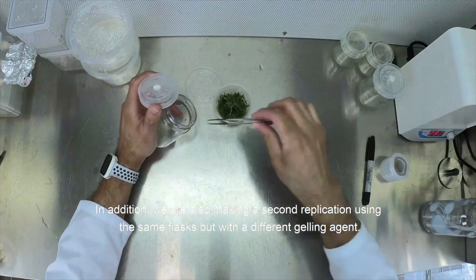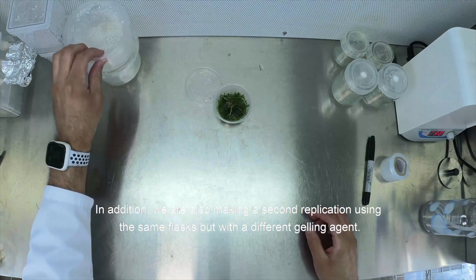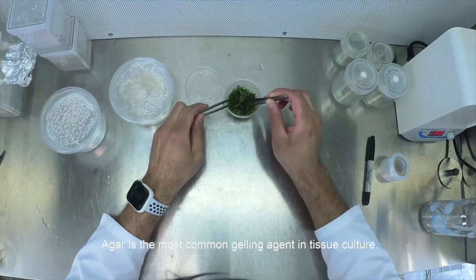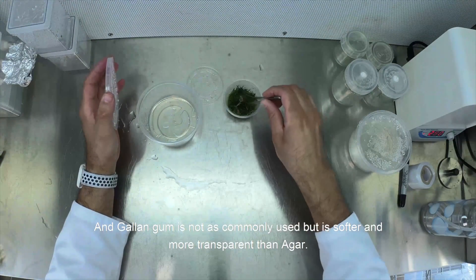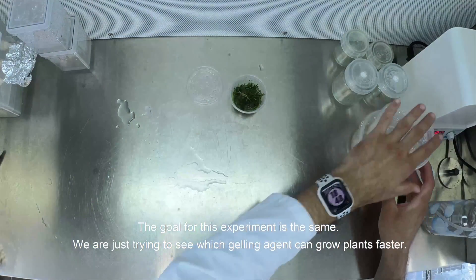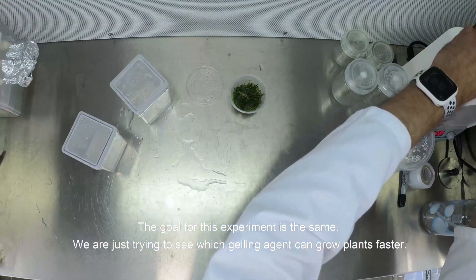In addition, we are also making a second replication using the same flasks but with a different gelling agent — agar versus gelangum. Agar is the most common gelling agent in tissue culture, and gelangum is not as commonly used, but is softer and more transparent than agar. The goal for this experiment is the same: we are just trying to see which gelling agent can grow plants faster.